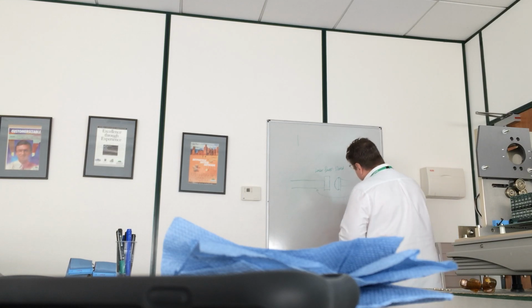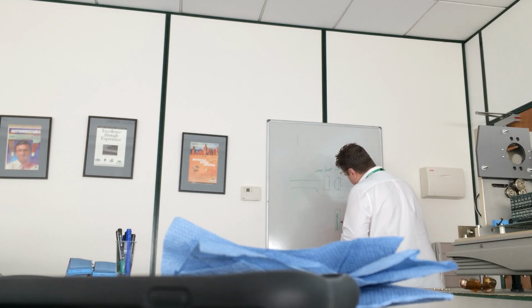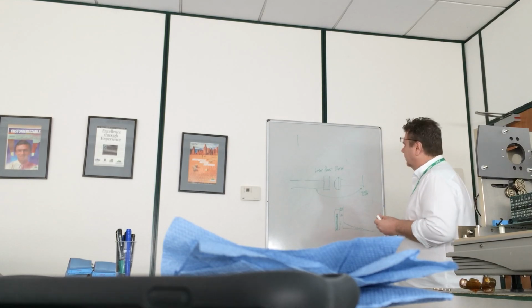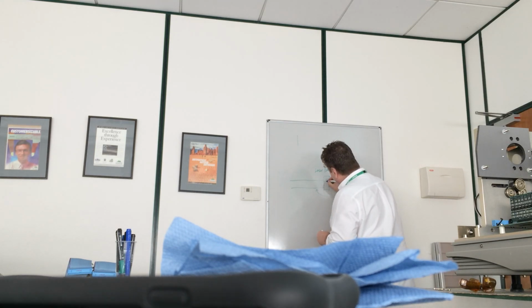Right, so here's our histogram. This is our laser power. I don't know if you've ever seen the alignment screen. And that's our background. 5, 10, 20. These are units of background. You understand that? Okay.